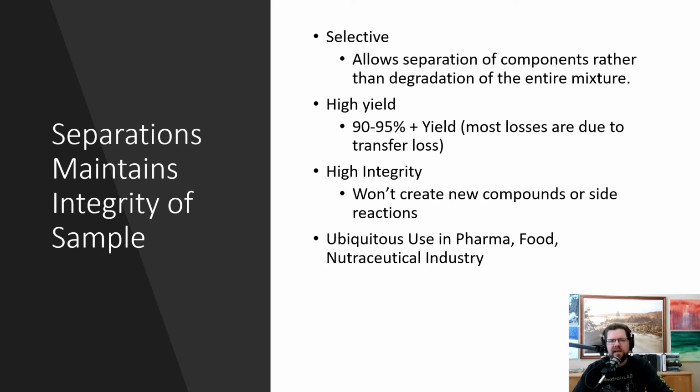The fourth thing is that it's a ubiquitous technique. It's used throughout chemical, pharma, food, and nutraceutical industries. There's a huge body of knowledge and also practitioners who do chromatography techniques. So if you have an issue, you can technically go and try to find someone to help you with the issue, or if you want to do a different type of separation, there's a tremendous body of literature out there that you can access and really use the versatility of your machine rather than just trying to cook it up.